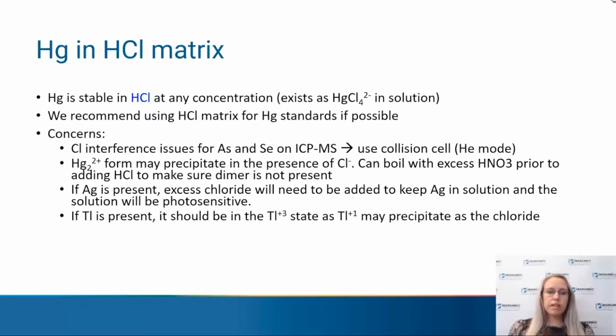We can give you some assistance there. But just be aware that if you do have silver and chloride in your standards or your samples, they're going to be photosensitive. So you need to make sure to keep those away from light to avoid formation of that solid silver chloride.